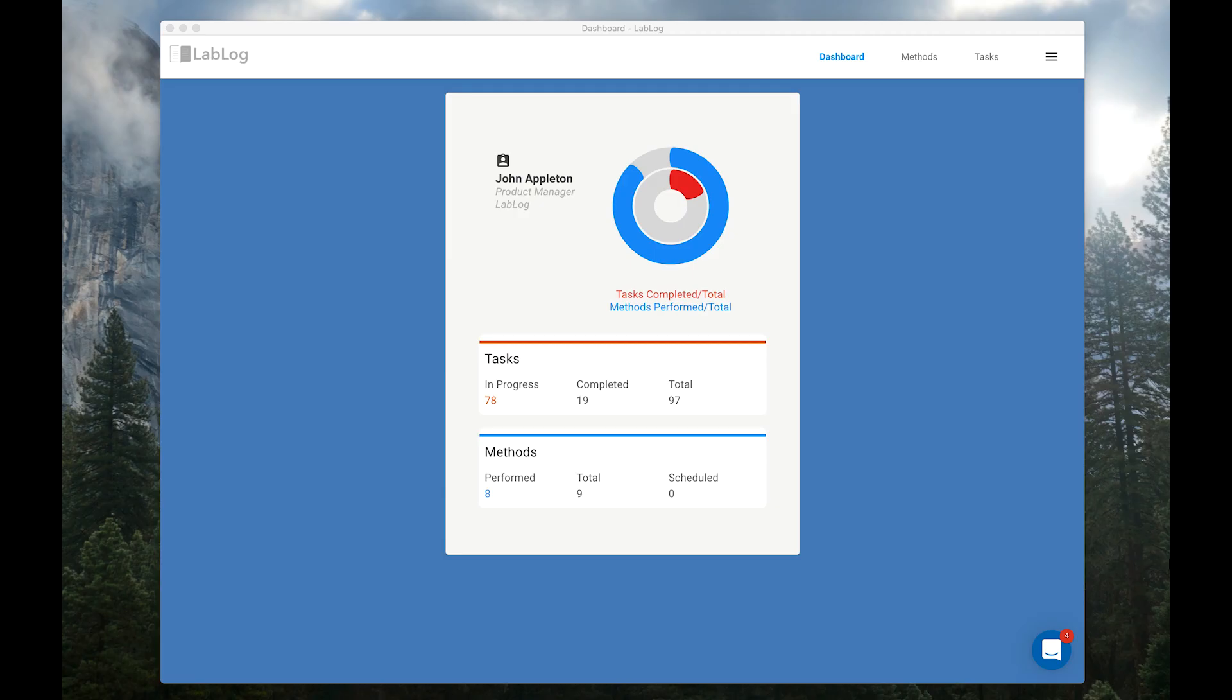Welcome to LabLog. LabLog is a new kind of lab notebook, bringing all your notes into one place, tracking your research progress every week.